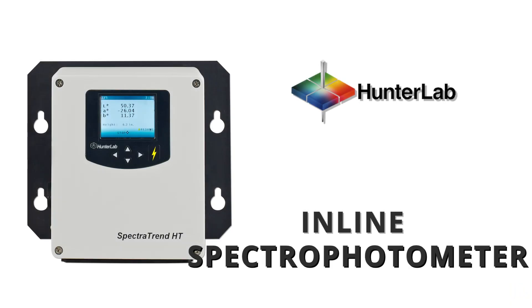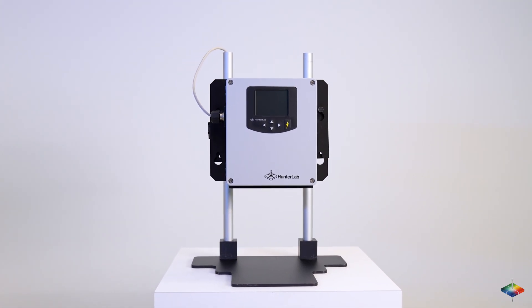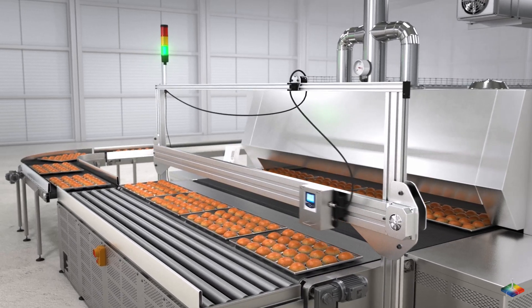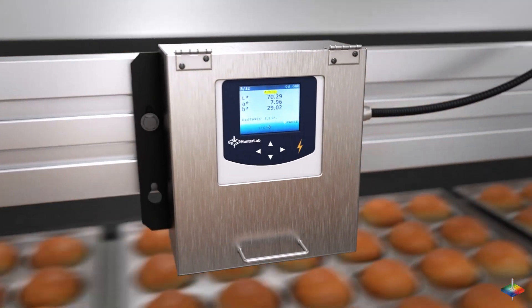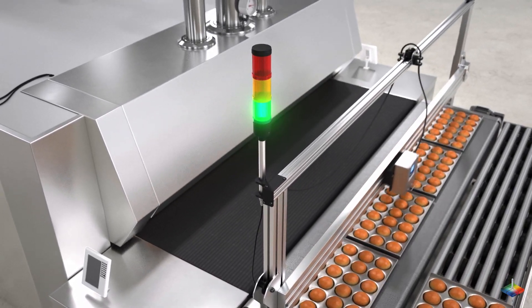Hunter Lab's SpectraTrend HT offers real-time continuous color measurements throughout the production process. Early warning signals allow operators time to correct color before a fail condition. Place the samples on the conveyor belt and the SpectraTrend HT takes continuous measurements to indicate pass or fail.